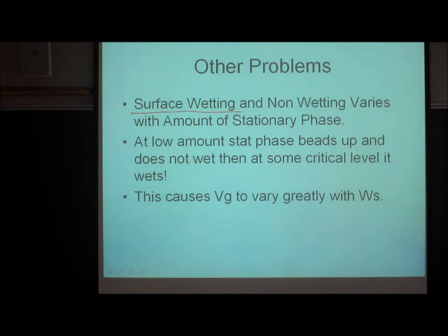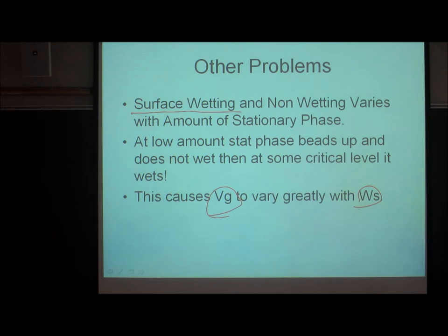When wetting doesn't work, you get very strange results. Plots of specific retention volume (VR-prime over WS) versus WS will not be linear or flat — they can actually show maxima. The peak shape is terrible, and the HETP is terrible. This is not something you want. You want to achieve a thin, uniform film.